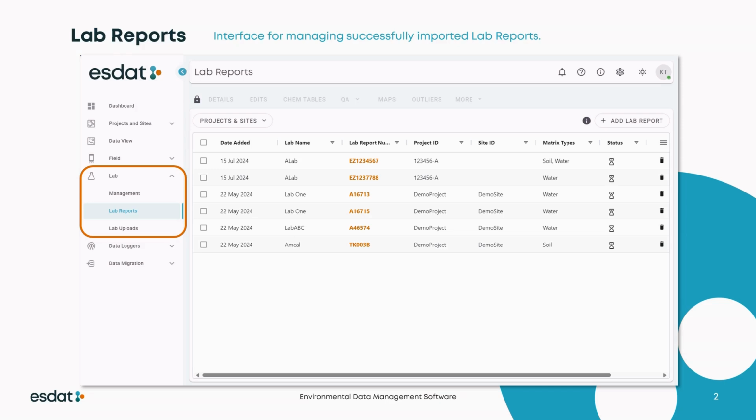As a user, you can select one or more laboratory reports and navigate to the details, edits, chem tables, or other views as shown in the image. If you would like to only view lab reports for particular projects or sites, you can filter them using the Projects and Sites menu above the Laboratory Reports list.